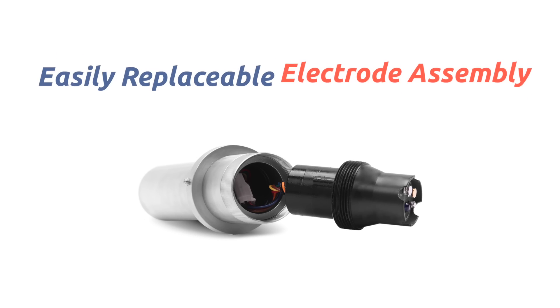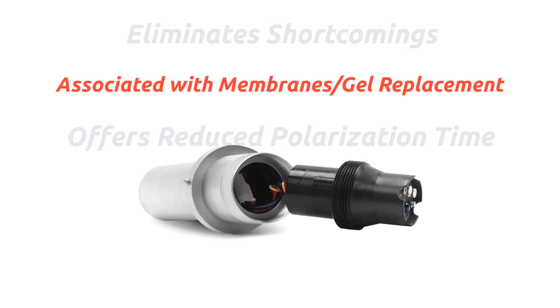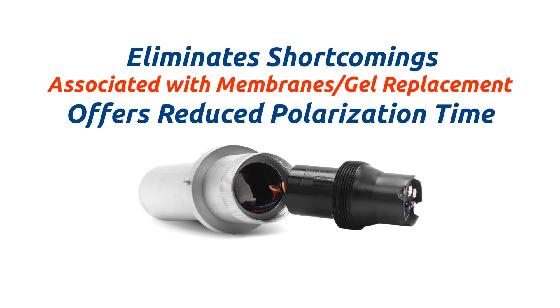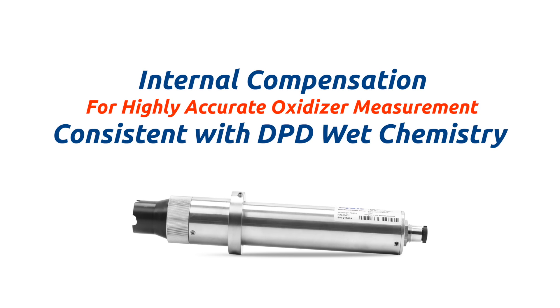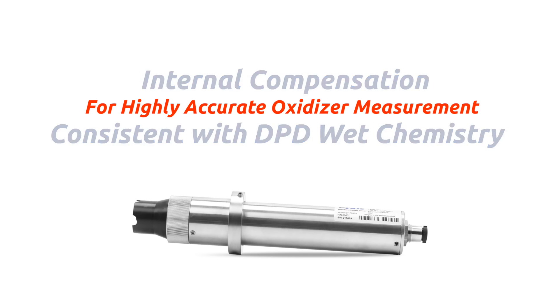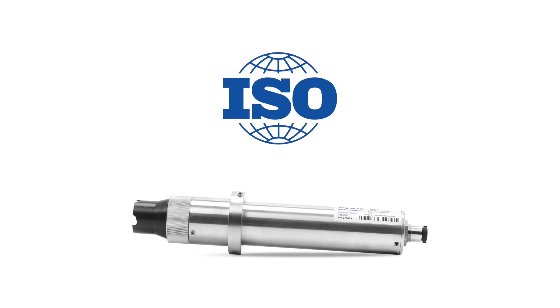The ST765 sensors offer an easily replaceable front-loading reference electrode assembly independently developed by Pixis Labs, eliminating the shortcomings associated with membranes and gel replacement while offering reduced polarization time during sensor startup and providing instantaneous residual detection. This platform with internal sensor compensation results in a highly accurate oxidizer measurement consistent with DPD wet chemistry methodology as high as pH 9.0+, and meets EPA 334.0 and ISO 7393 compliance.